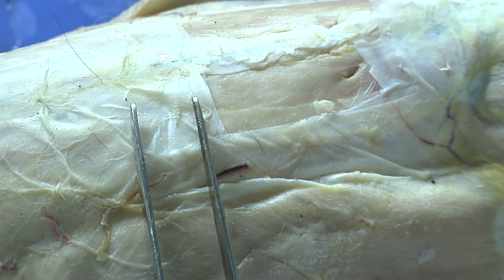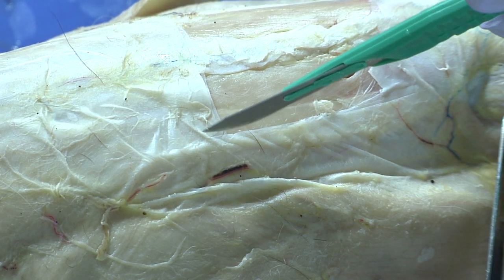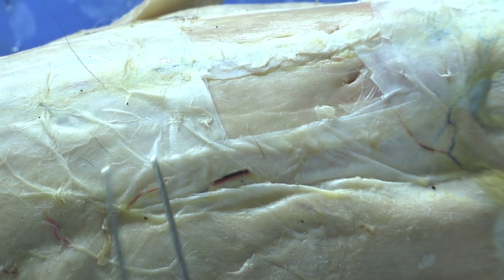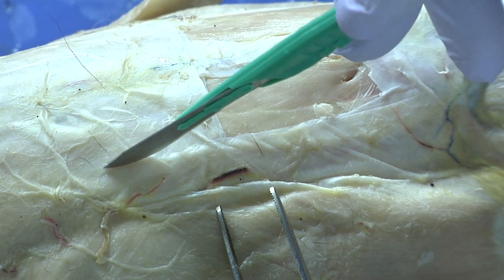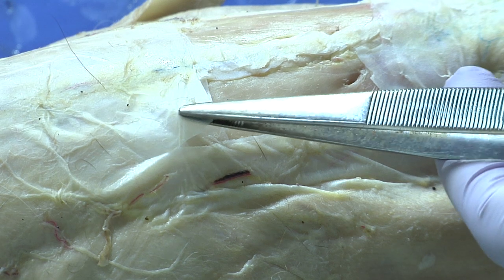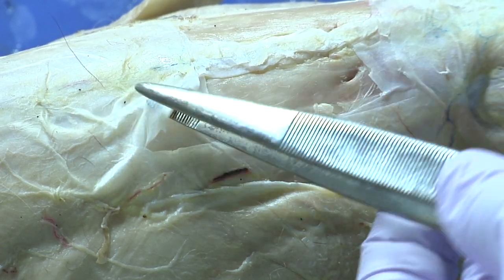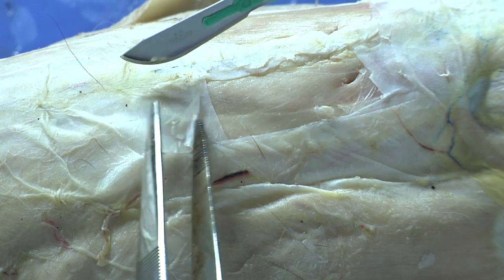What you'll need to do is create a little window like I've already done. You'll do that with your scalpel, creating a window about an inch to an inch and a half square to reveal those muscles. I'll do this again up here just so you can see — when you first make the cut, there's actually a double layer of connective tissue, so that first cut will probably just get you through the first layer. Using the forceps and the scalpel, you can create an opening here.